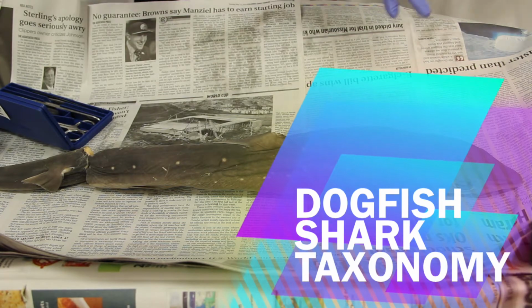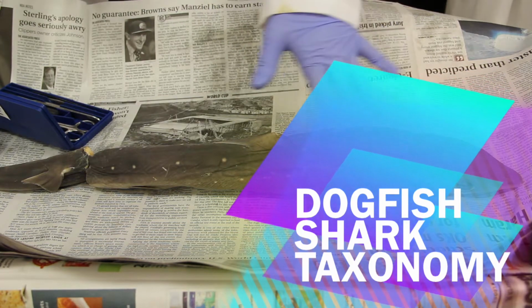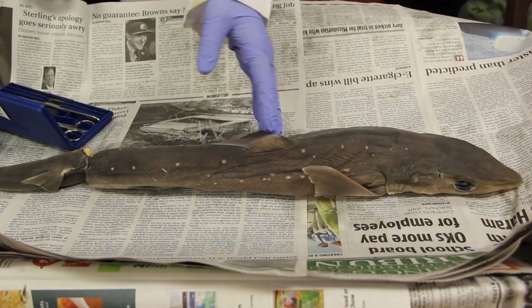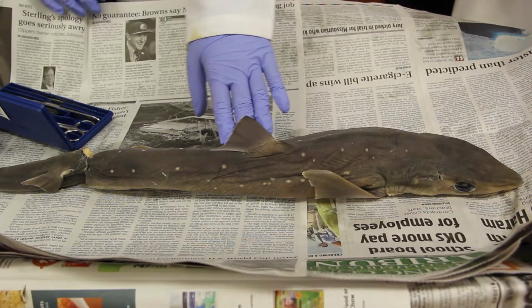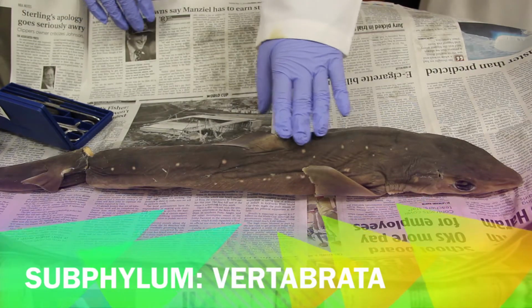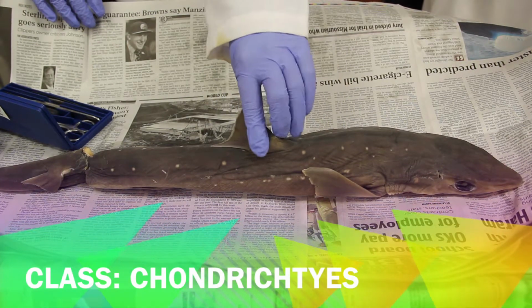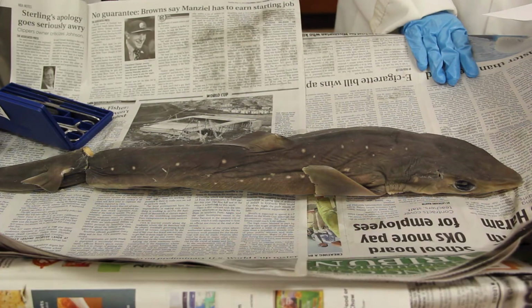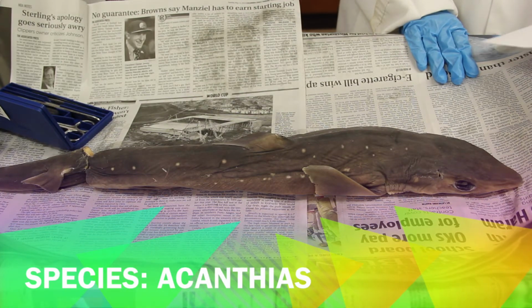Alright, going off of what Minna just said, for the dogfish's taxonomy, its scientific name is the Squalus acanthias, and its kingdom is Animalia, phylum is Chordata, subphylum is Vertebrata, class is Chondrichthyes, order is Squaliformes, family is Squalidae, genus is Squalus, species is acanthias.